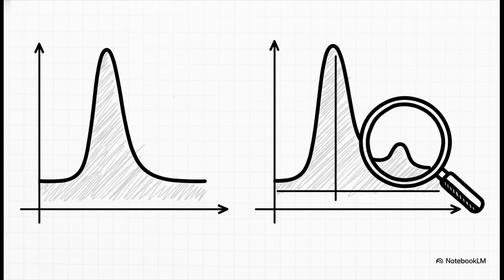And this is where DMA is an absolute superstar. Its sensitivity. Because it's a mechanical test, it can actually detect really subtle molecular wiggles and movements, things that DSC, which only looks at heat flow, completely misses. That sensitivity gives you a much more detailed map of your material's behavior.